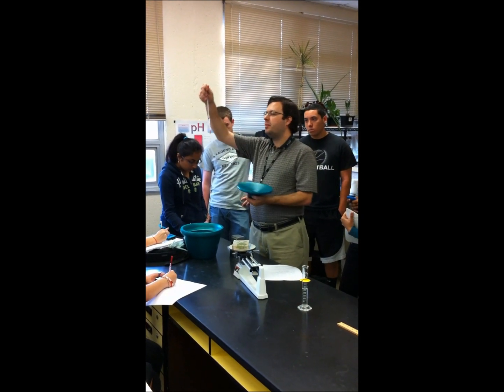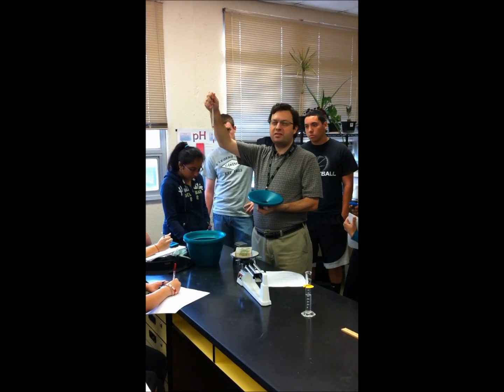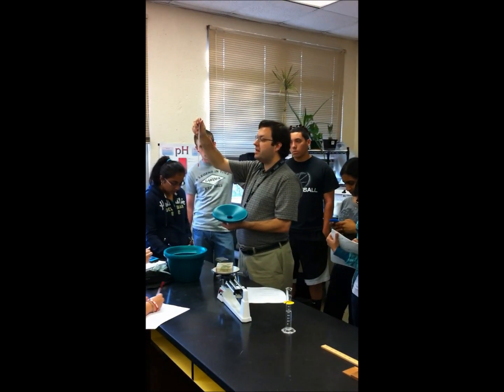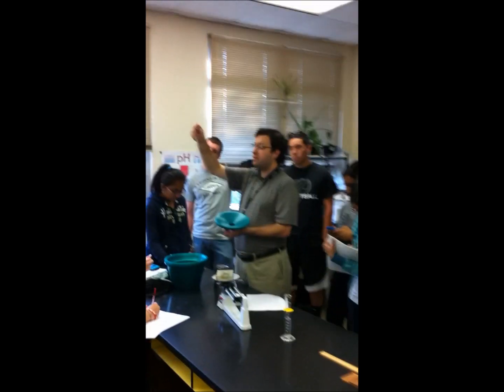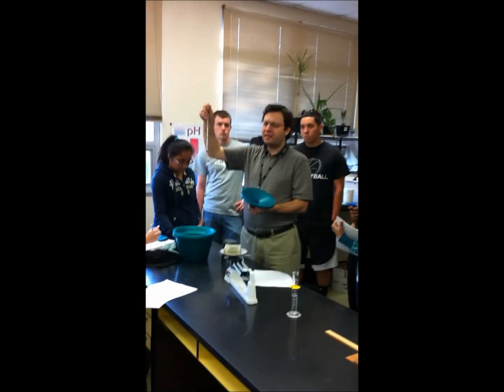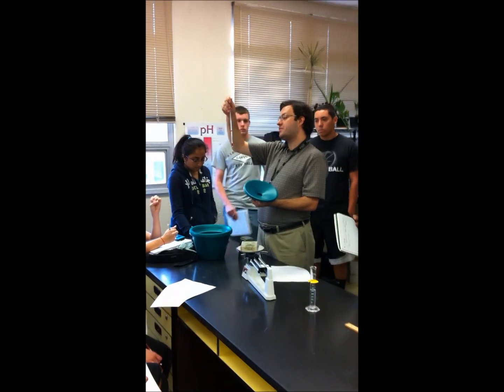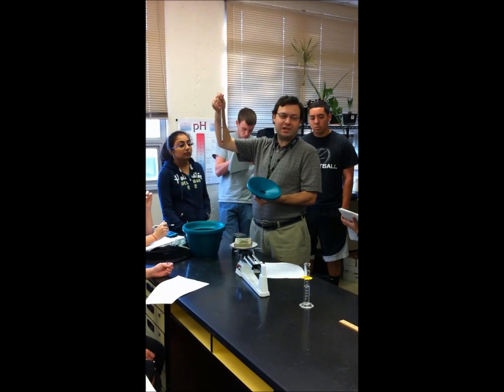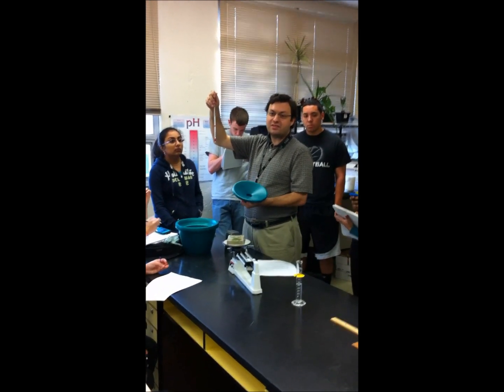Other than that, remember we measure these to the closest accuracy of the instrument. So on the thermometer here, we can do it to about 1 degree. Okay, try not to do any guesstimates. Like for this one, it's reading 22 degrees and a little bit more. So don't say 22.3. Just do it to the closest degree.